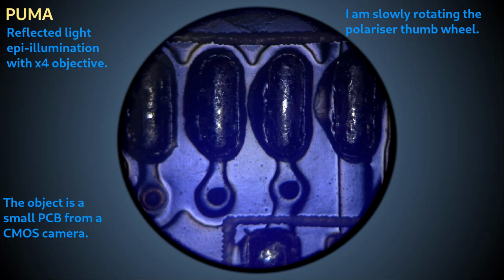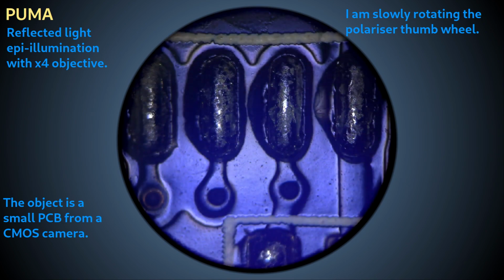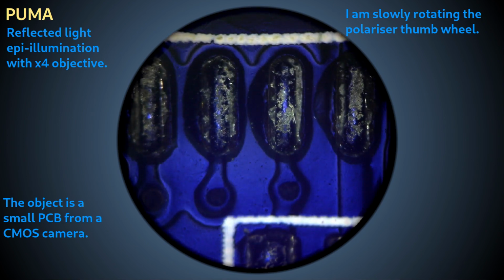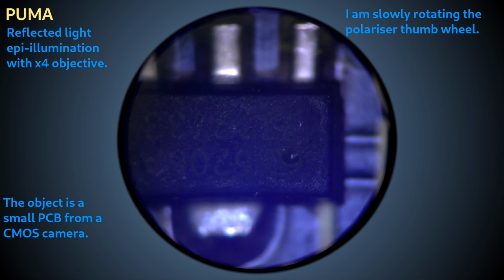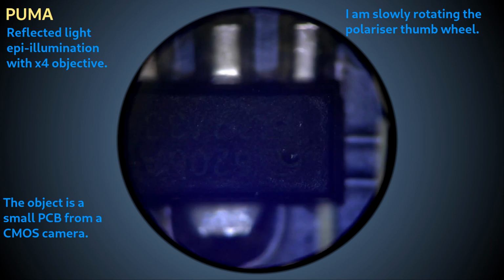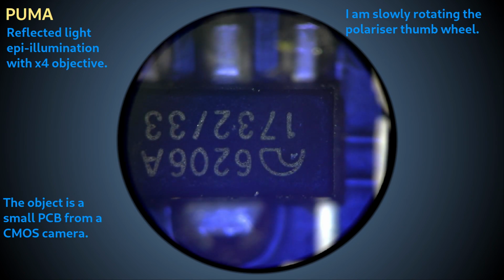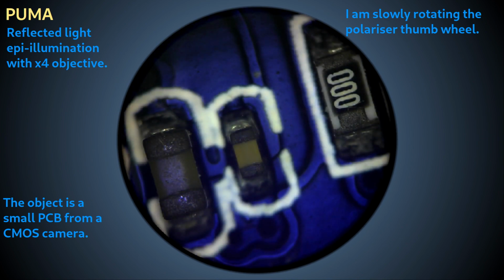Before we look at the silicon chip die, here is an example of reflected light epi-illumination for a circuit board from a CMOS camera at low magnification. Note how rotating the polarizer greatly improves the contrast by filtering out some of the back reflected light. Note also how some structure, such as the printed information on the components, can be greatly enhanced or even disappear, depending on the angle of polarization of the illuminating light compared to the angle of the analyzer filter.